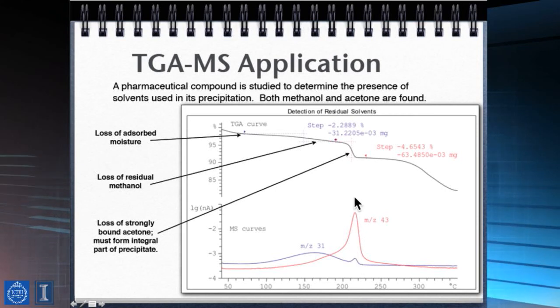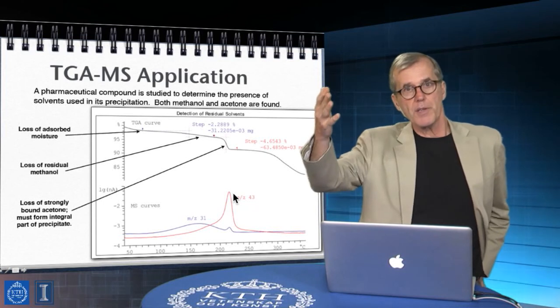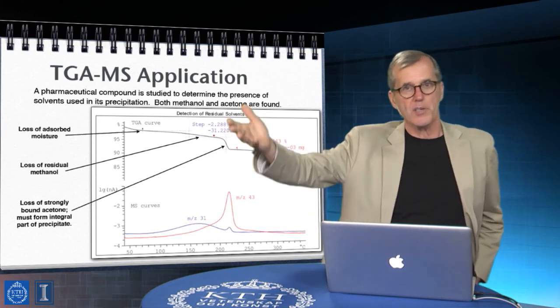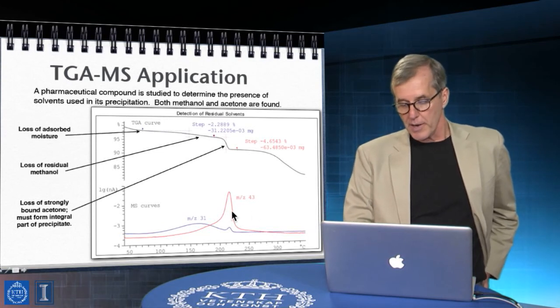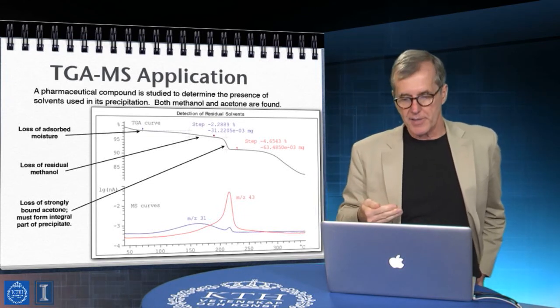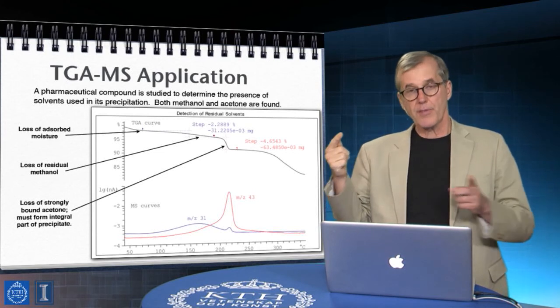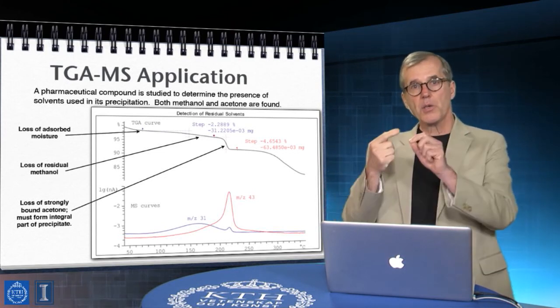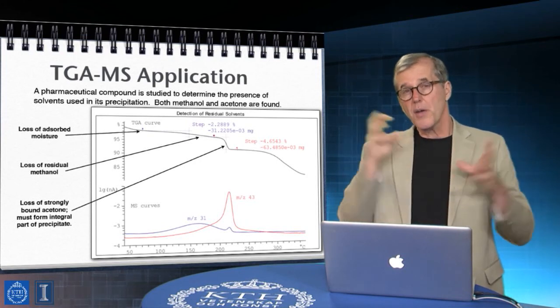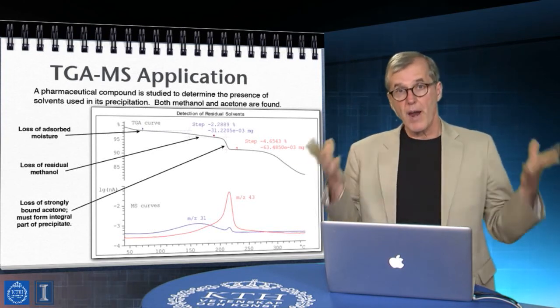But that's the nature of mass spectrometry. So here's a detail: these ions are not being directly desorbed into the gas phase, as would be the case for a SIMS measurement, where the ion event generates an ion liberation event. These are being generated by the ionization of neutral molecules in the gas phase. They're ionized via what's called electron impact ionization. An electron beam is present at the front end of the mass analyzer, and that electron beam hits molecules that come into the ionizer region. That electron-molecule collision not only generates a positive ion by knocking out an electron, it deposits enough energy into the molecule to fragment it into pieces.